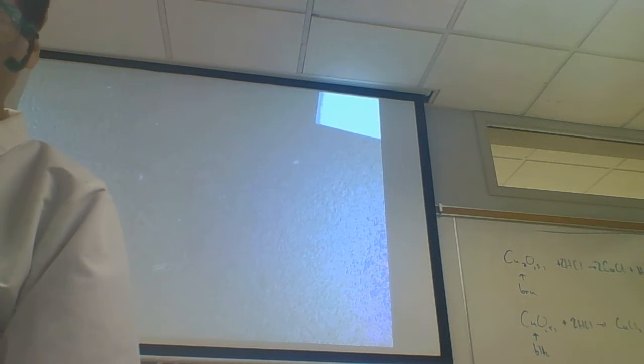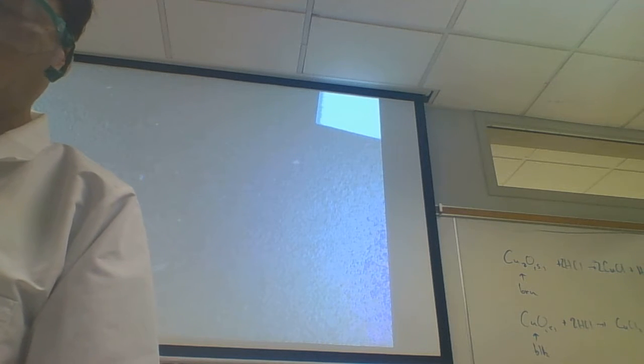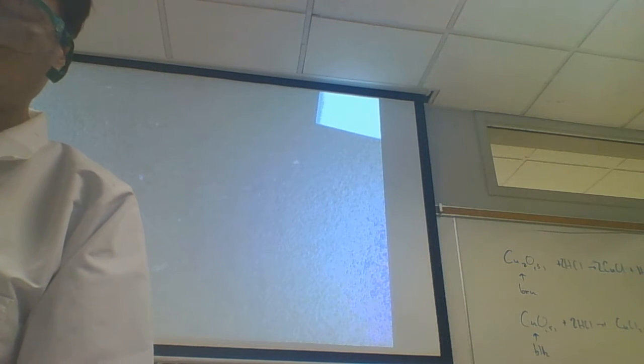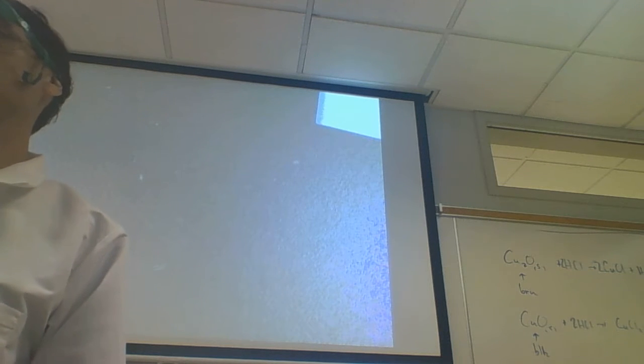What do you predict for this one? No reaction. No reaction, yeah. That's correct. No reaction is predicted. But just to be sure, we'll give it some time. Initially, nothing's happening. But maybe I didn't give it long enough to react. Some reactions are sluggish.